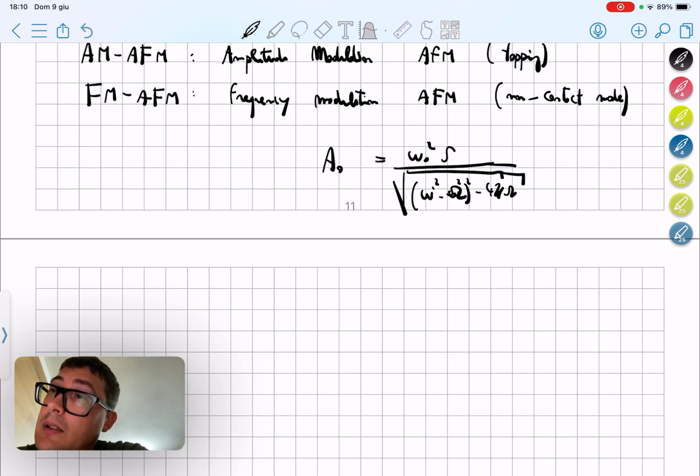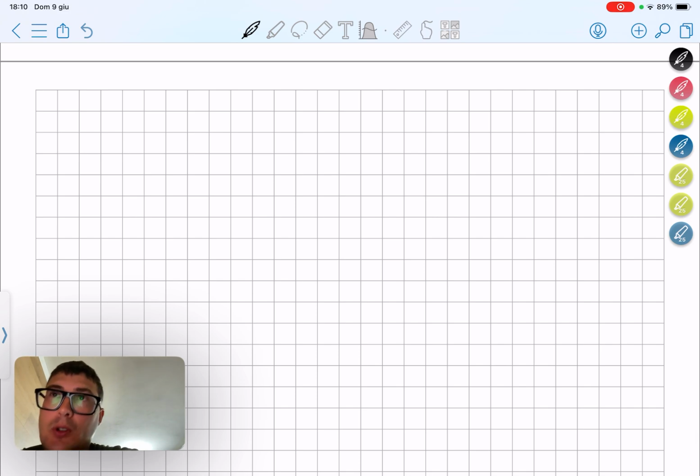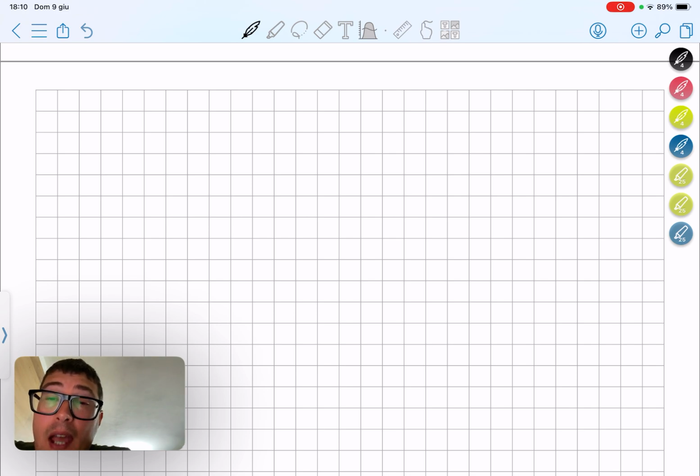But as soon as we approach the sample, there will be a modification of the amplitude, in part because of the gradient of the interaction, and it will cause an increase or a decrease of the amplitude according to the distance.